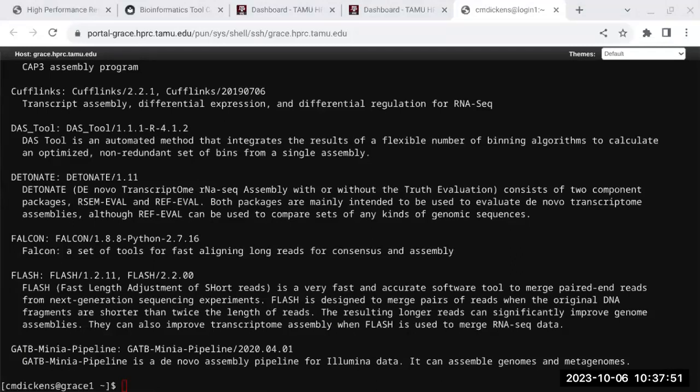So we're going to just go through how to load software. If you want to work through this, loading software on Grace and FASTER, our newer clusters, is different than loading it on Terra. We used to have a way to directly just load a module, but then it was very confusing because we have these tool chains, and people would mix tool chains and libraries would get out of order and the software wouldn't work correctly.